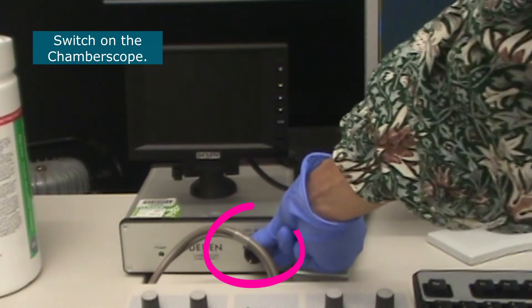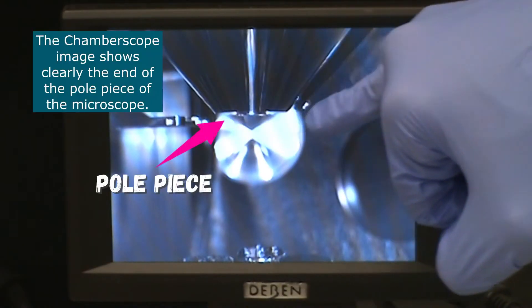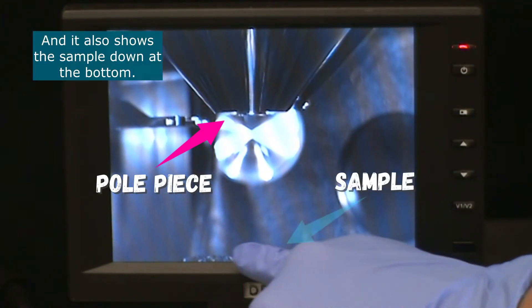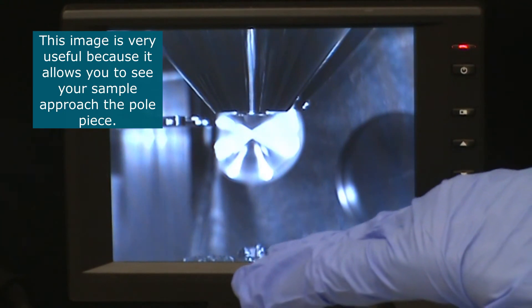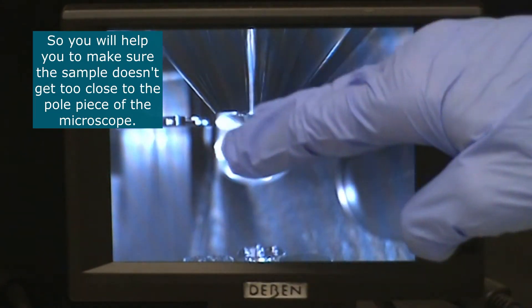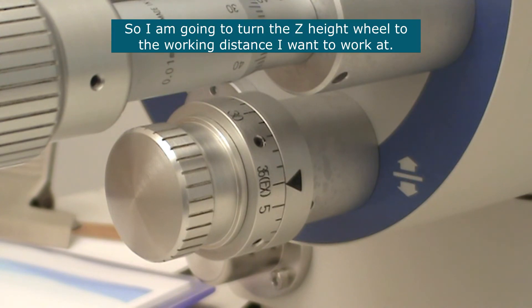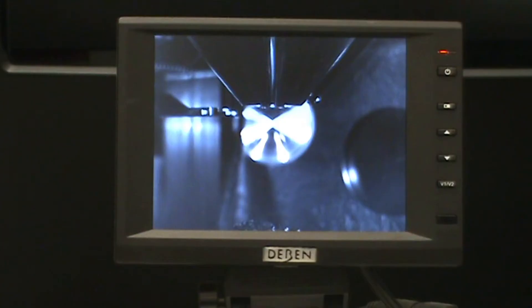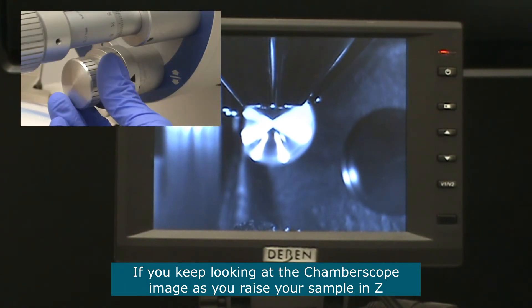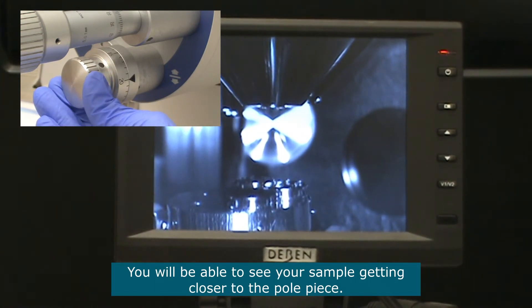If you switch on the chamber scope, the image clearly shows the end of the pole piece and the samples below. This is very useful because you'll be able to see your sample approaching the pole piece and how close it's getting. You don't want it to get too close. I want my structure of interest to be at a shorter working distance, so I'm going to turn the Z wheel to reach my desired working distance. Keep looking at the chamber scope image as you raise your sample in Z — you'll see it getting closer to the pole piece.